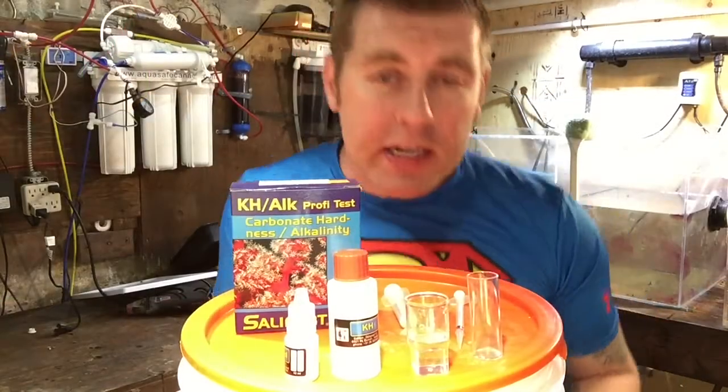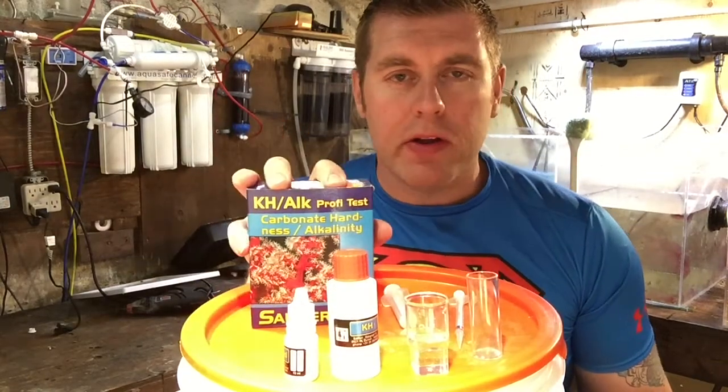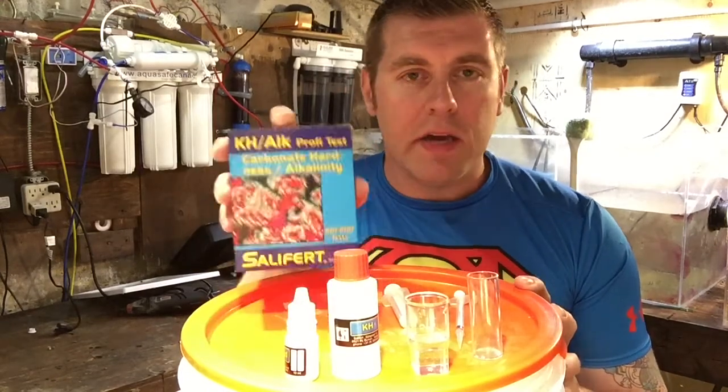Hey YouTubers, Barnboy Reef here. On today's episode we're going to do another test from Salifert — the KH alkalinity test. It's a very good test, just like my other episodes on calcium and pH. It's very important in a reef tank. Your corals need the carbonate to build their skeletons, so you want to make sure and keep those in check.